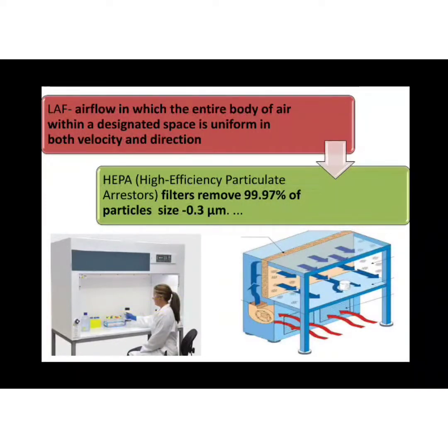Next, what I need to do is switch off the UV and switch on the blower, then open the shutter, switch on the burner and do my inoculation or any work in front of the burner. Now, what is the working principle? Where are these HEPA filters located or placed? HEPA filters could be located here on the top or at the back side.